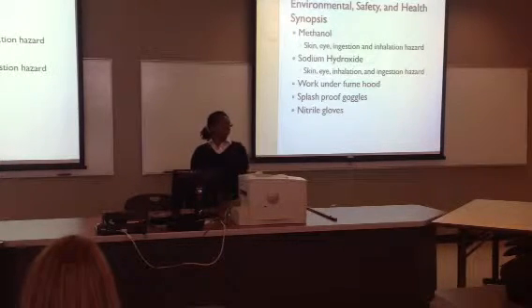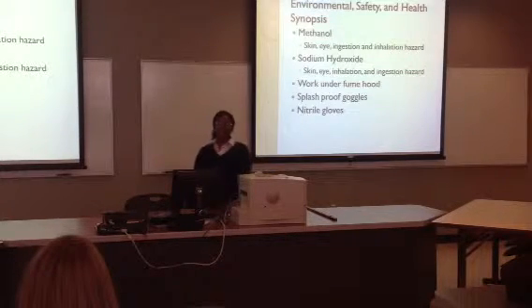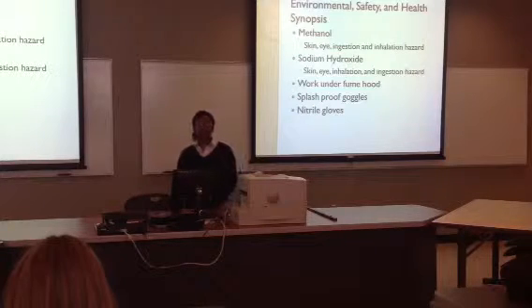In this experiment, we use methanol and pelletized sodium hydroxide, and both of those are skin, eye, inhalation, and ingestion hazards. So for personal protective equipment, we use splash-proof goggles, nitrile gloves, and work under the fume hood.